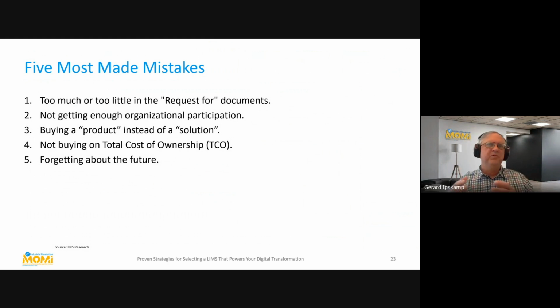Make sure you get a good feel of your partner, if it's a vendor or a solution provider, system integrator. You have to work with them probably at least 6 months, but probably longer, and the relationship is important there. And forgetting about the future, I mentioned that already. Ask for functionality for the next 5 years also.